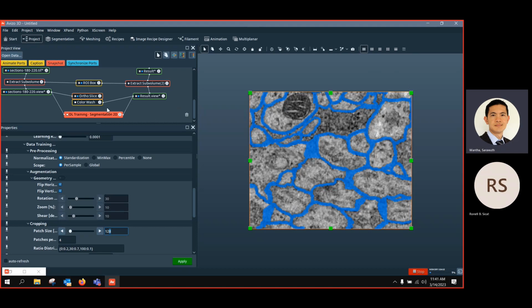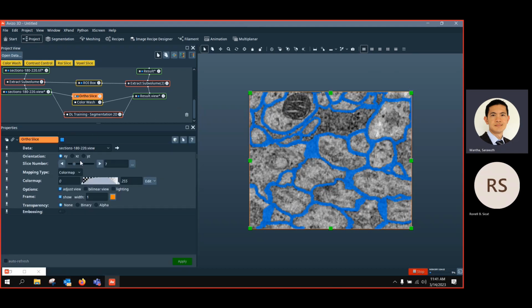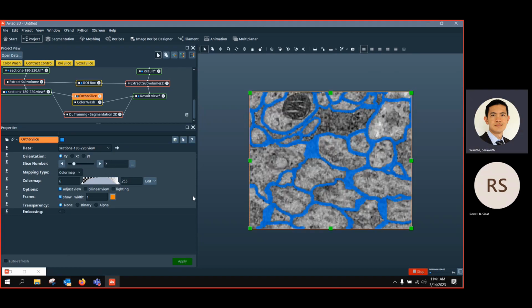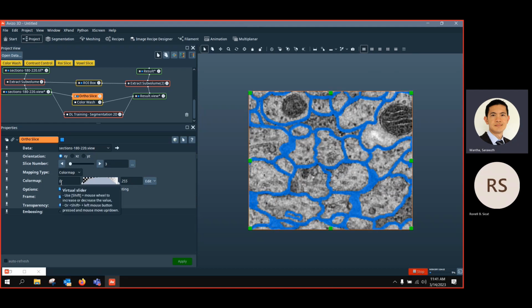And when I say all the data, you can imagine that actually we have 3D images, right? So we have about 30 slices, and the patch goes to each image, to one slice, then the second, and so on until it gets from top to bottom, with the 128 patch going around like in a raster scan, and then that completes the cycle. So that's one epoch, and then say we want to run this 100 times, 100 cycles, so you run 100 epochs.